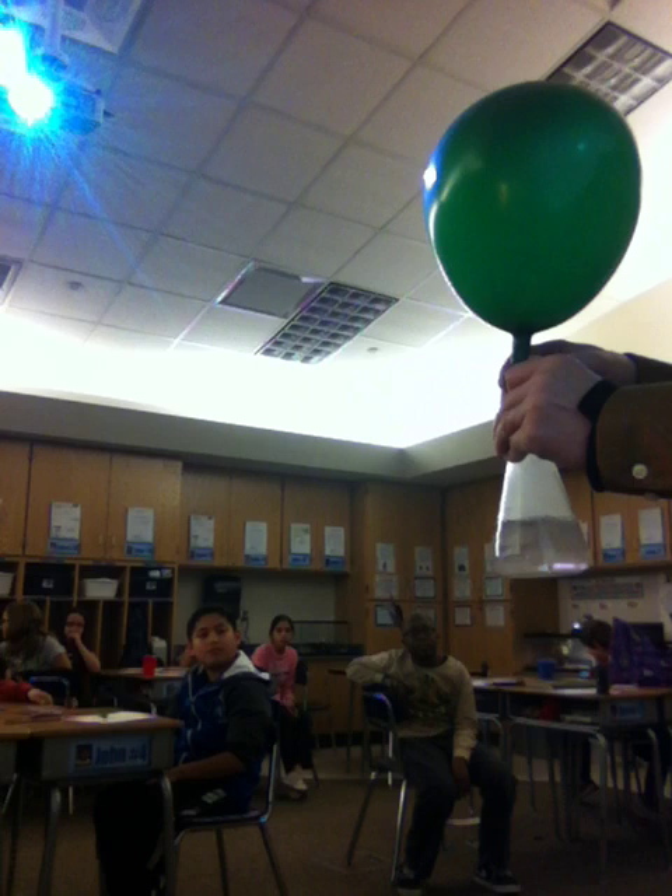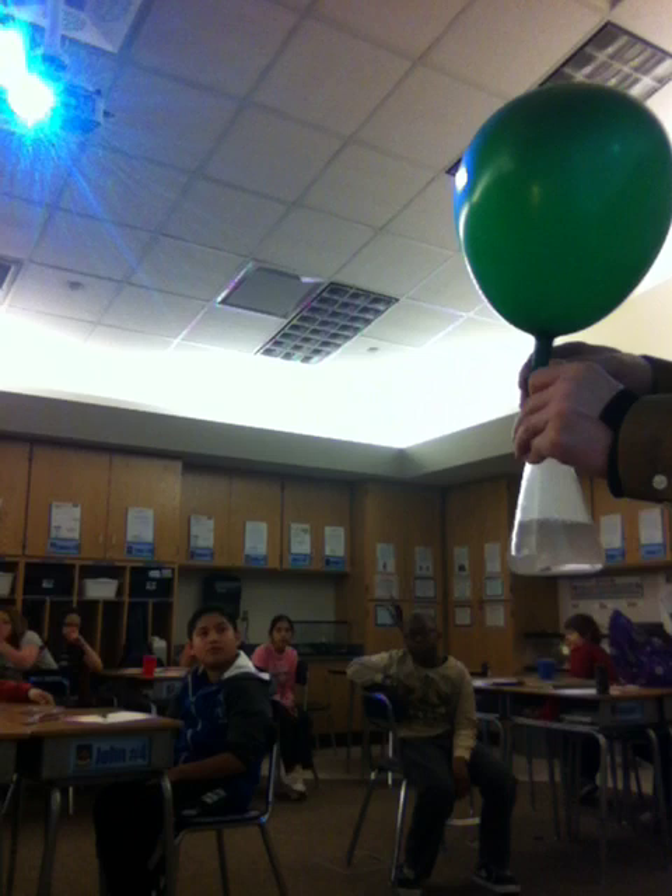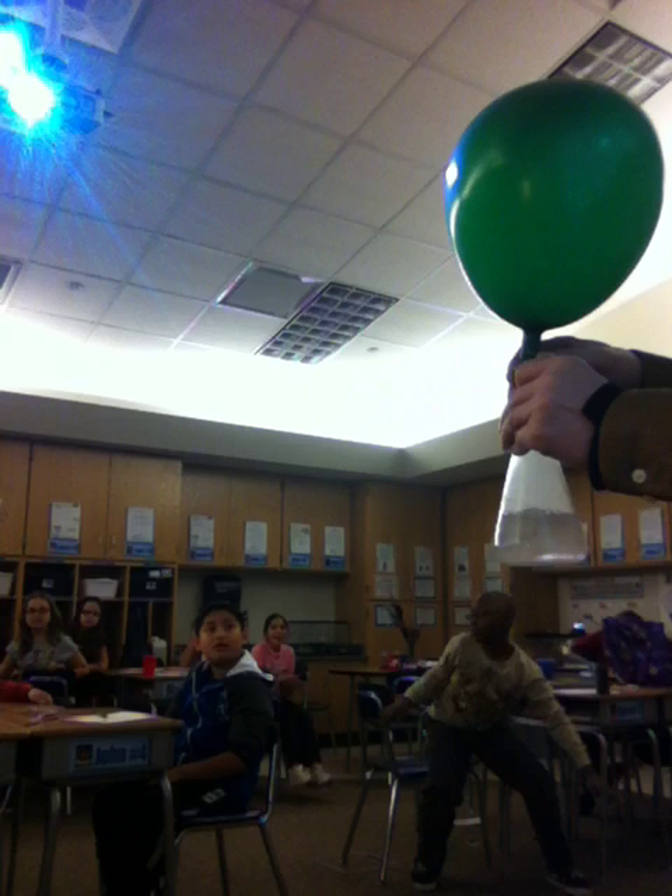I wonder if it's going to be a flame. Yeah, it will be a big flame — a ball of fire just like the Hindenburg. We'll flip the lights out and this balloon will be a ball of fire.